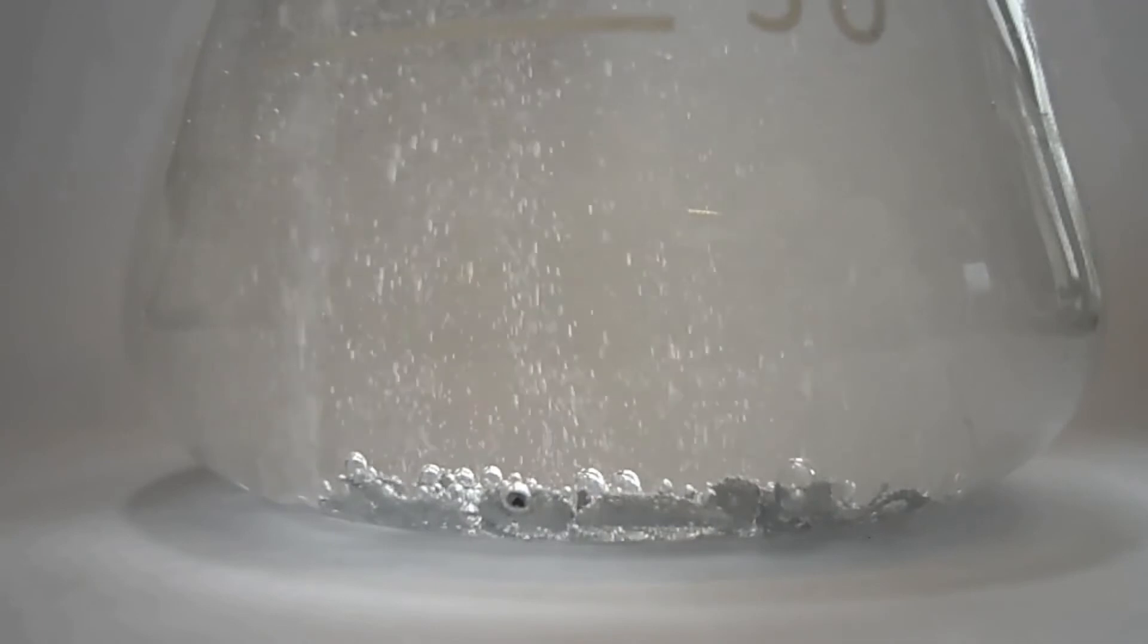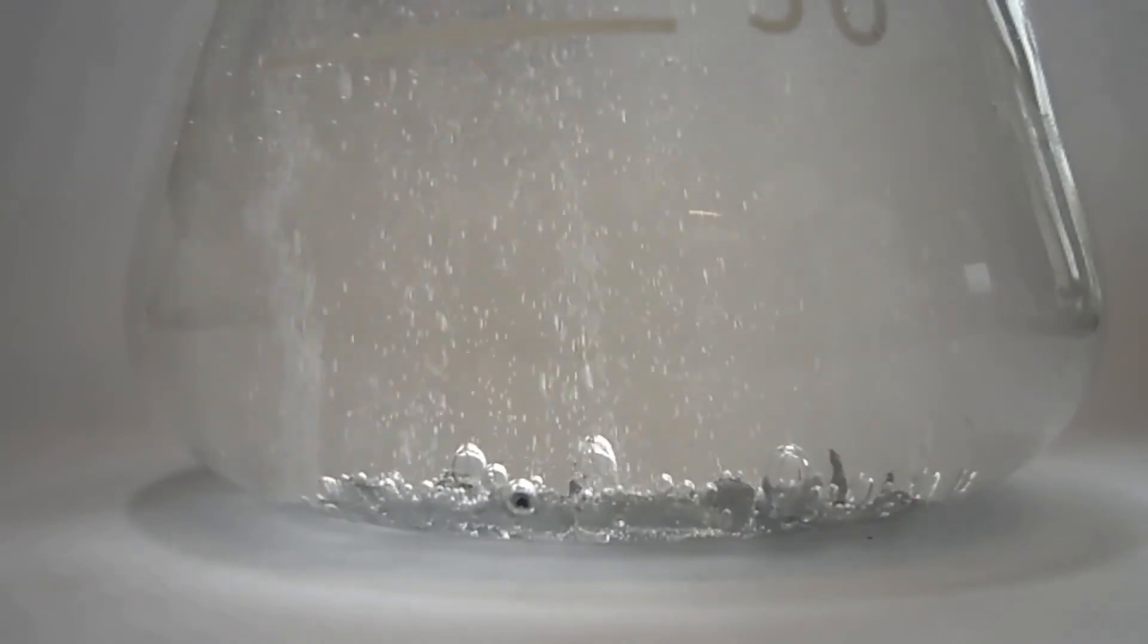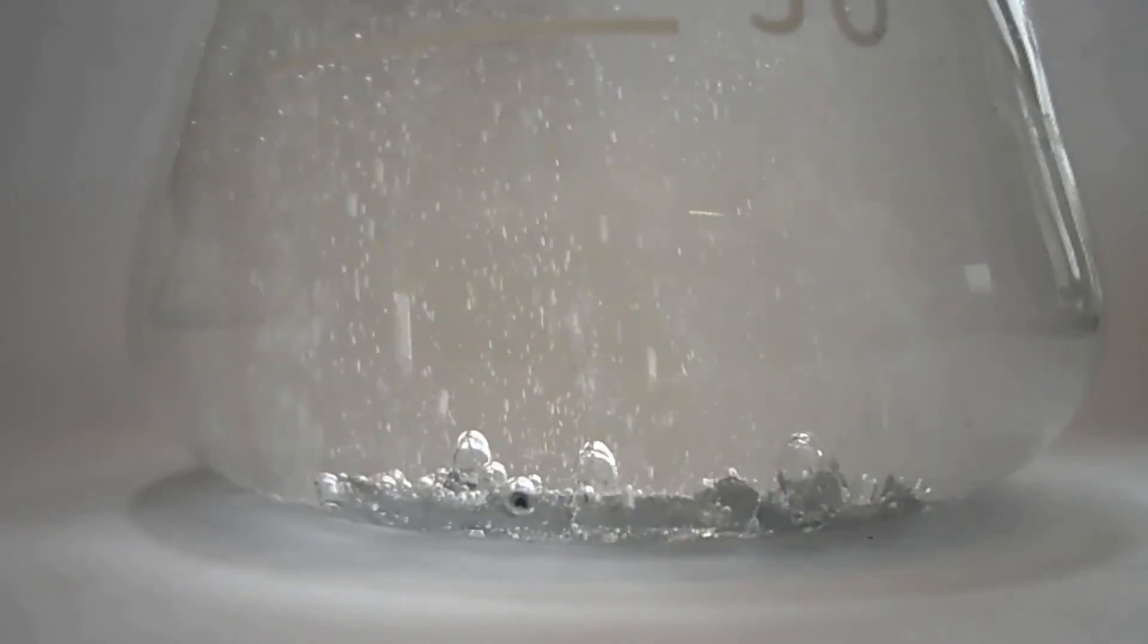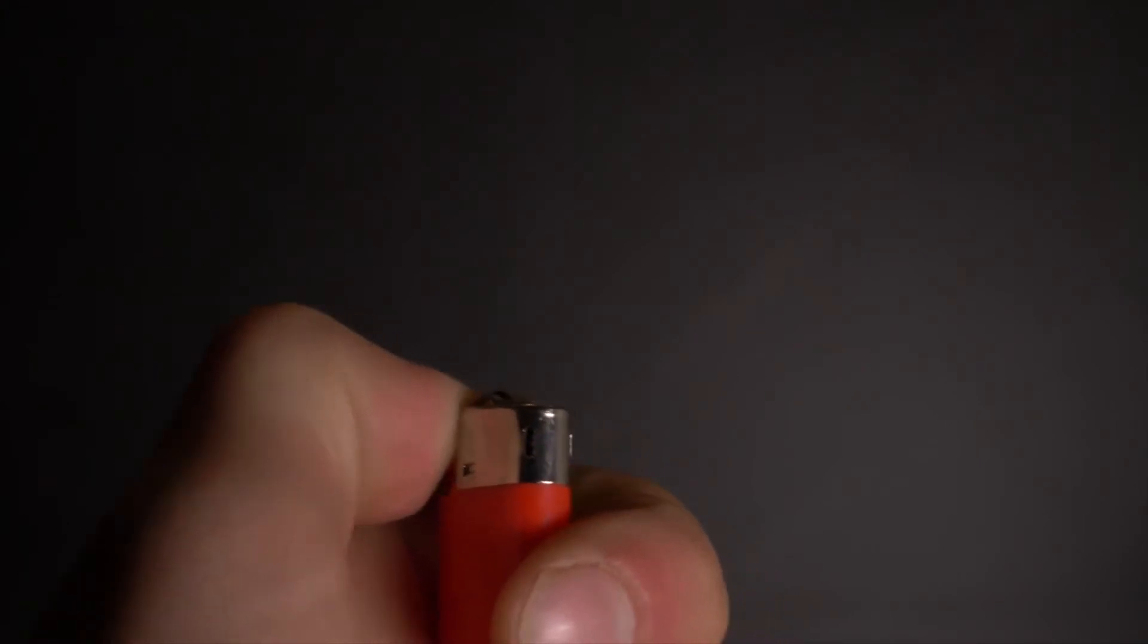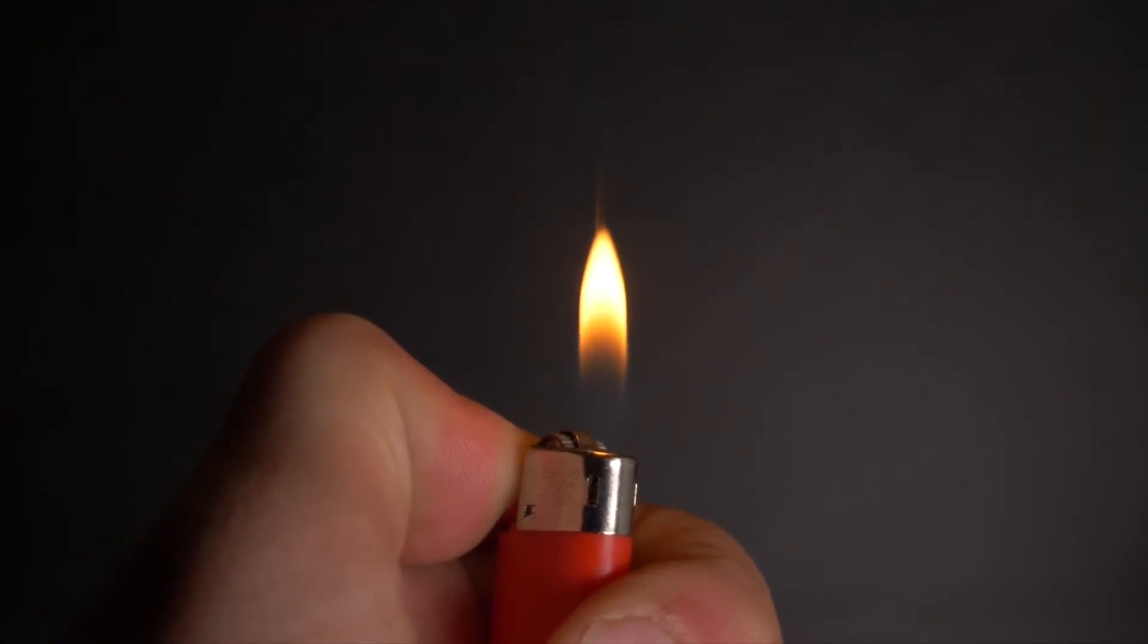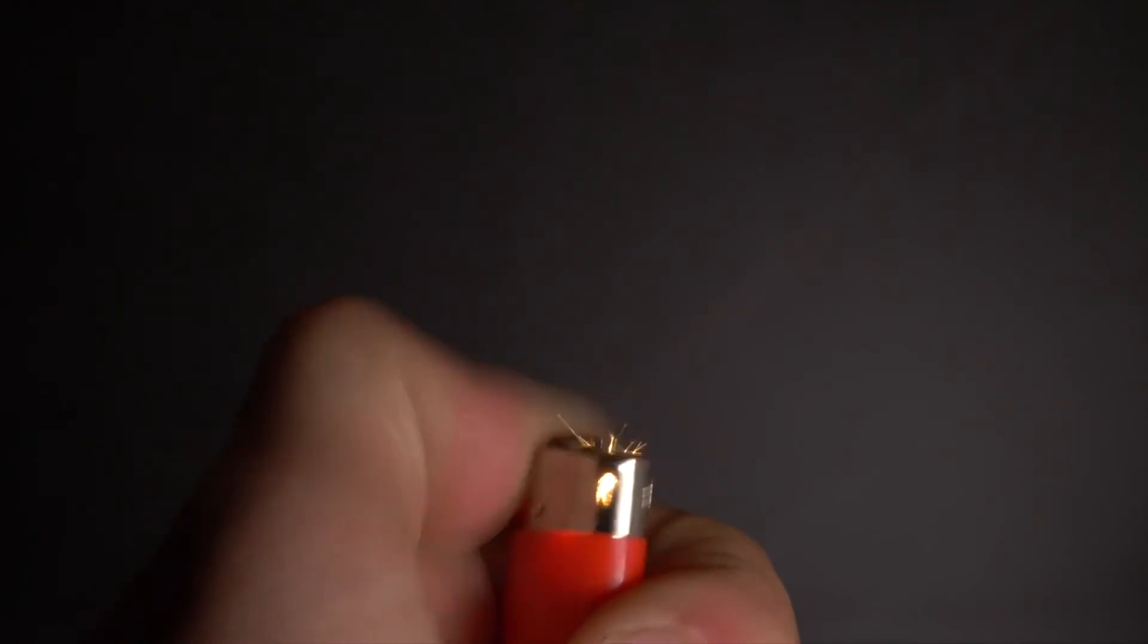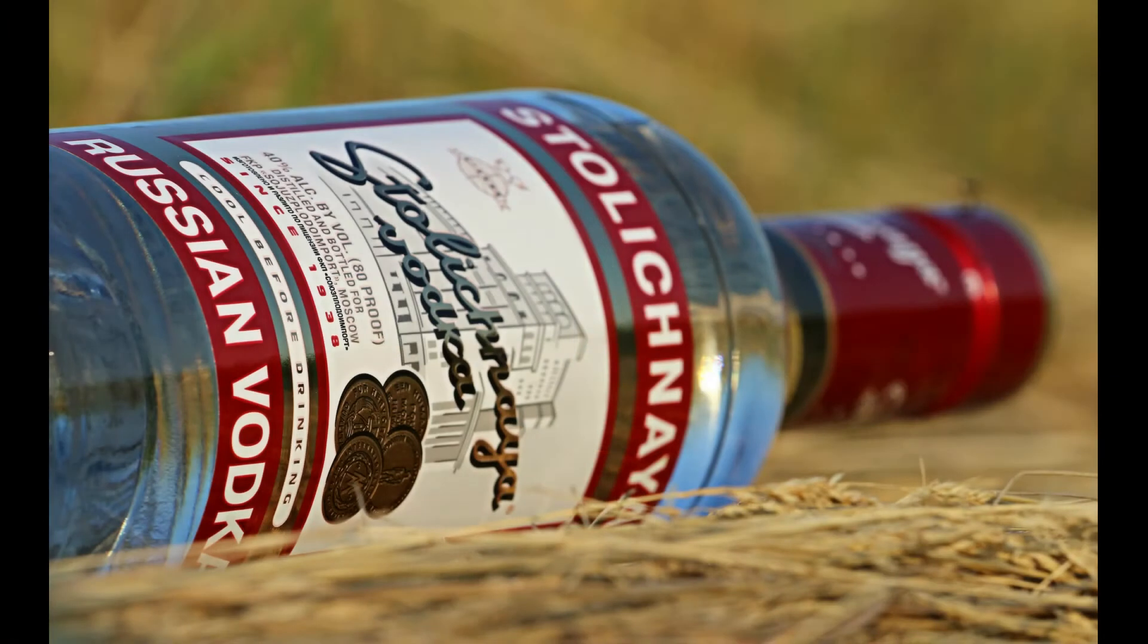Finally, there are your ethanol-based solvents. Although ethanol is used here, you could in theory use methanol and other products if this was not being consumed and is more commonly used in a laboratory. Your other solvent groups are, to be quite blunt, dangerous. Petroleum can explode and is extremely volatile. Supercritical CO2, apart from the fact that the temperature issues exist, is also quite dangerous and poisonous. Ethanol or other alcohol-based solvents are used if you're looking to add whatever it is you're extracting to alcohol, food and drinks. In very broad terms, it is safe, in so far as alcohol can be said to be safe anyway.